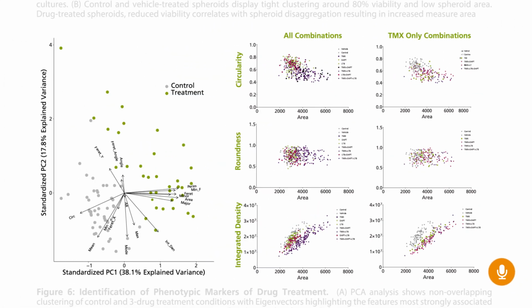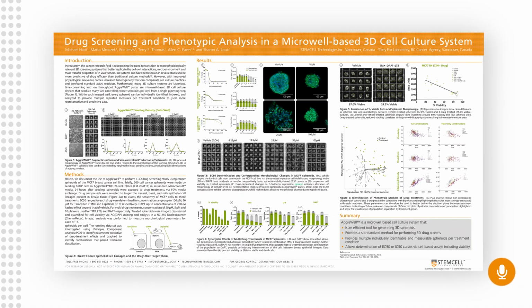So these analyses show that using only cell culture images and image analysis, we can clearly identify an effect from no effect. This means that when repeating this experiment with drugs of unknown effect, we would be able to determine if there was a substantial viability effect based solely on image analysis data.